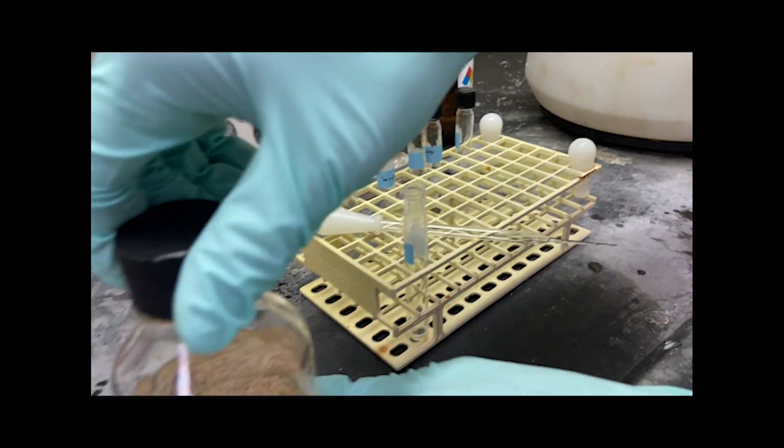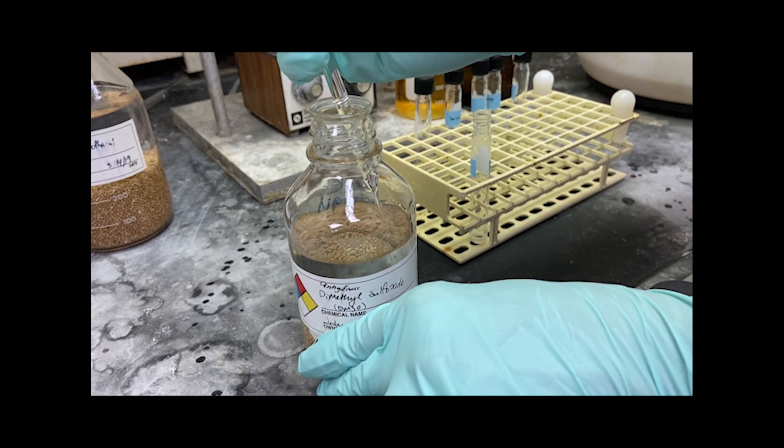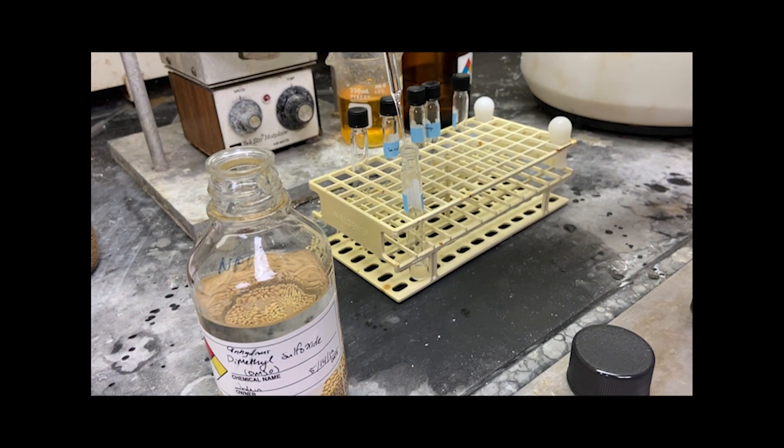After the final wash, we add 2 milliliters of DMSO to the base solution and vortex the solution, and the base is now ready to be added to the sample.